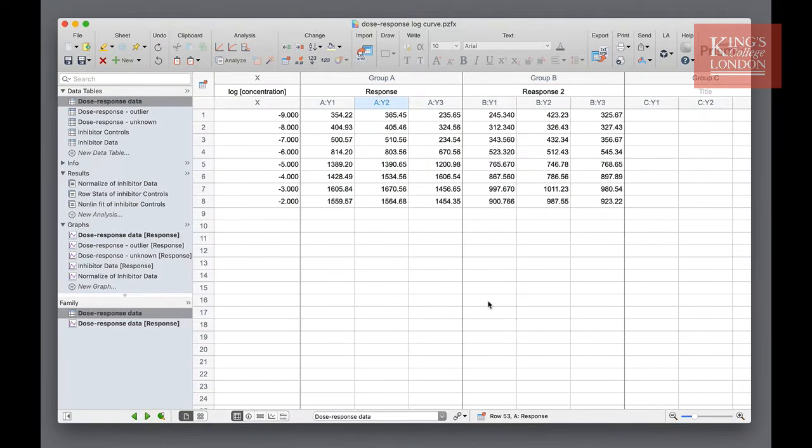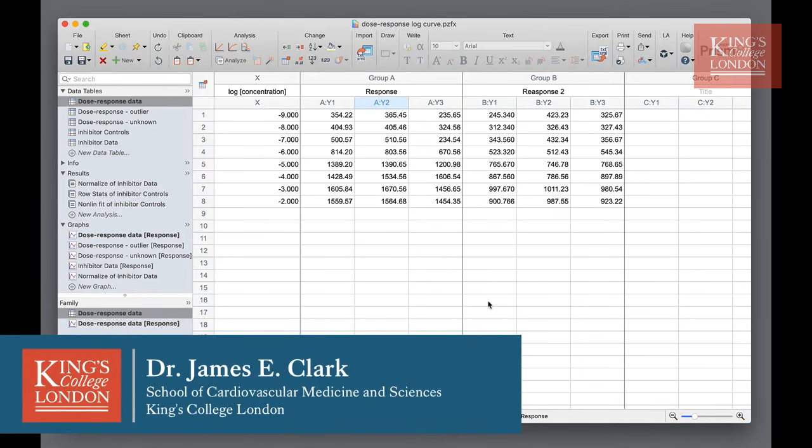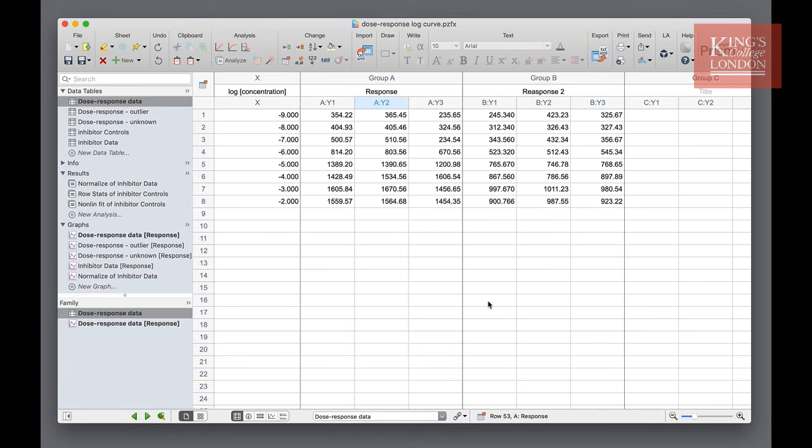Hello, I'm James Clark from King's College London, and in this brief video I'm going to look at nonlinear regression in GraphPad Prism. Unlike linear regression, which simply involves plotting a straight line through data, nonlinear regression can involve a number of different nonlinear models.